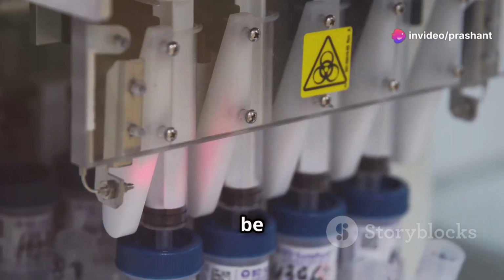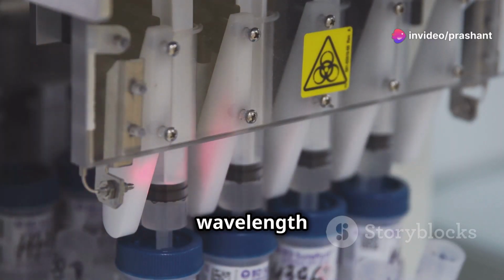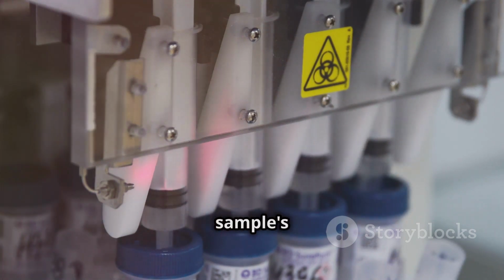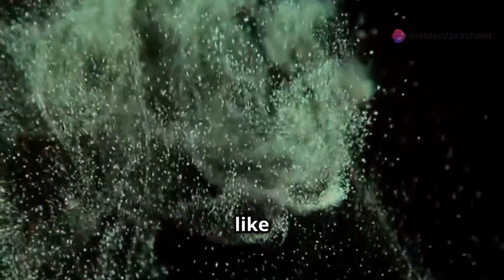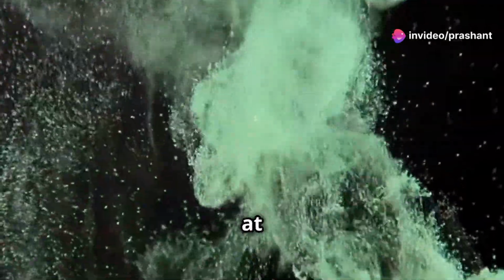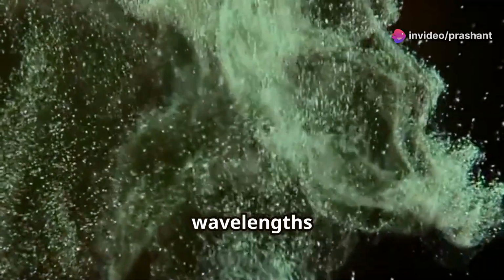This process can be time-consuming, as each wavelength must be analyzed individually. However, it provides detailed information about the sample's molecular structure. FTIR, on the other hand, is like a high-speed camera for molecules. Instead of analyzing one wavelength at a time, it captures all wavelengths simultaneously, providing a comprehensive snapshot of the sample in a fraction of the time.